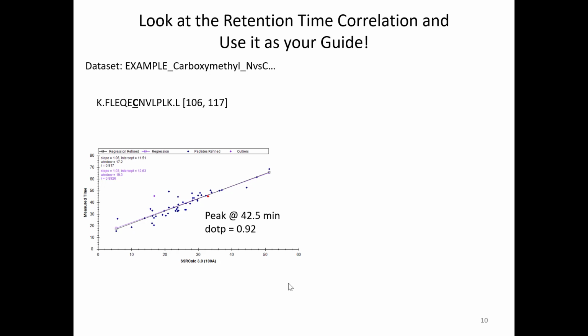The other thing I use is, even if a peptide hasn't been observed in a spectral library, there's this awesome correlation with the hydrophobicity that is calculated in Skyline for your peptides versus where the actual peptide comes out. You see the regression is pretty decent. We get like a 0.9 correlation coefficient. And this is interactive. If you have data where the peptide's been selected in a chromatogram and its hydrophobicity has been calculated, which it is by default, you can click on any one of these peaks and it brings you to that peptide and shows you the chromatogram.